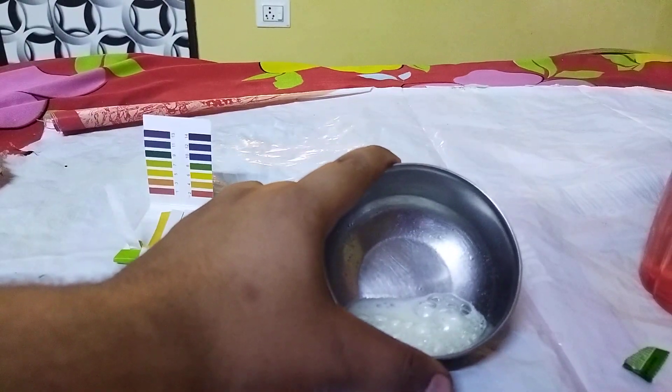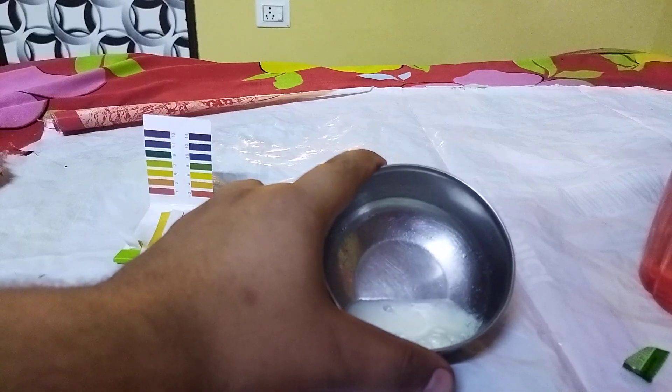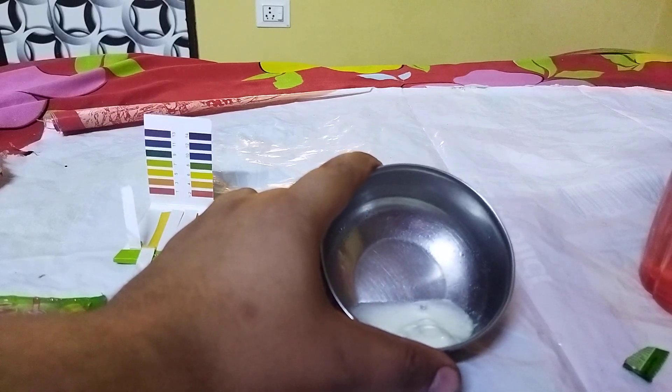It's very bubbly! Let's wait for it to settle down and calm down.